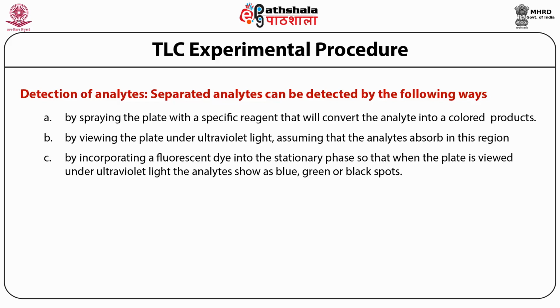So this setup is a typical setup that is used for running TLC plates. The colored spots here correspond to individual lipids. The arrow that is marked as the origin is one edge of the plate where the lipid samples were initially spotted. These samples, as I told you, were dissolved in organic solvents and then spotted onto one edge of the plate. The glass chamber contains a system of organic solvent.